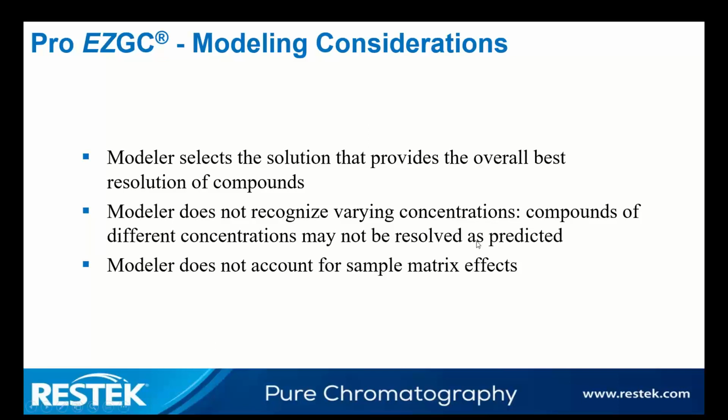In different concentrations, when we first put this out, all of the peaks were at the same height, and customers were completely turned off by that. So what we ended up doing was adjusting the peak heights to make it look more real. That has some customers thinking that it's real sometimes, but it also makes it look much more natural. If they're all at the same peak height, it looks like a terrible chromatogram, honestly. But if we have a high concentration analyte, it might not be resolved from a low concentration analyte that comes out right next to it.